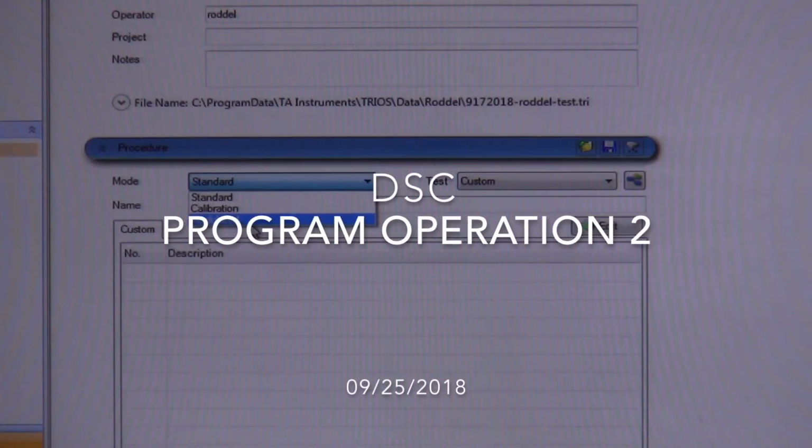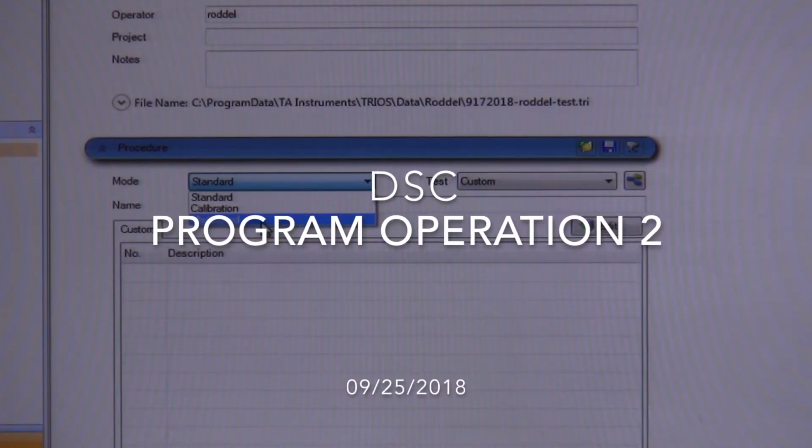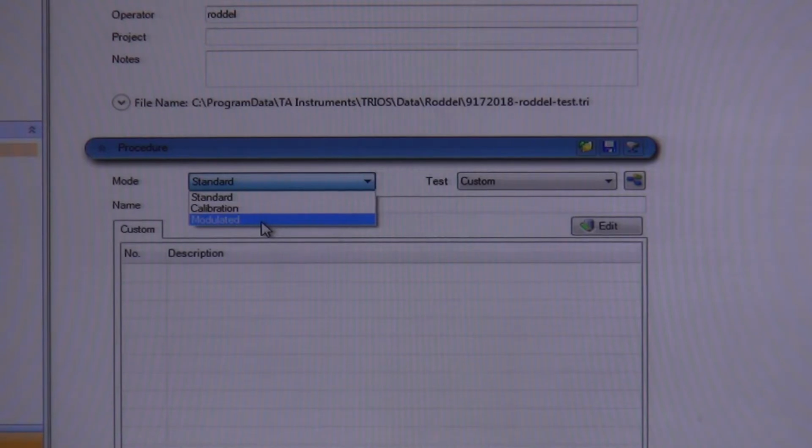That's all I'm going to mention about it, because there are a few more things you need to know about modulated before you actually use it, but I won't be going into that today. So most people, again, will be using standard mode.